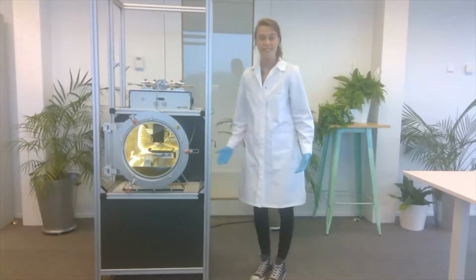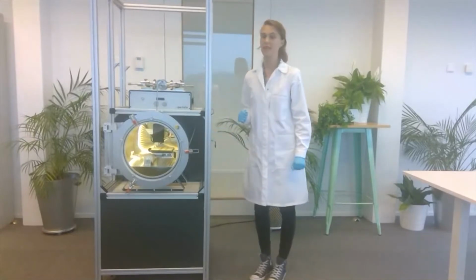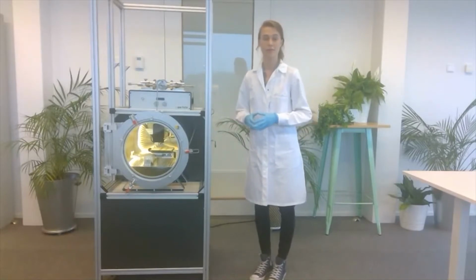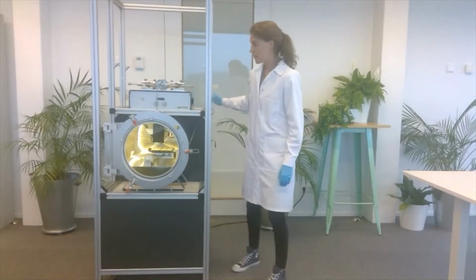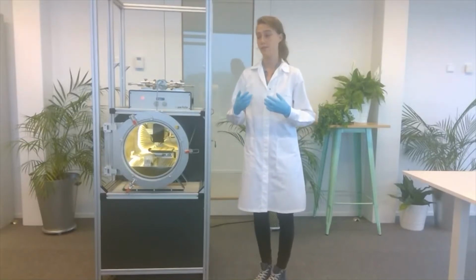So I'm currently standing next to the nanostructured material printer. I just mounted the reactor head onto the G1 base unit and screwed it down with some pins to make sure we have proper connection. Now I can turn on the G1 and it will start aligning the electrodes. When it has found the proper distance between the electrodes, it will be ready to spark.